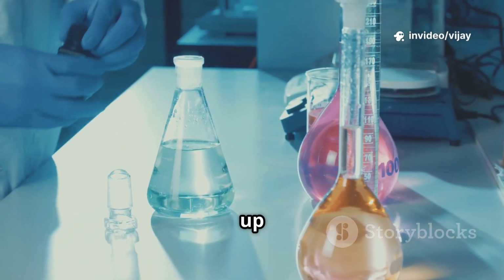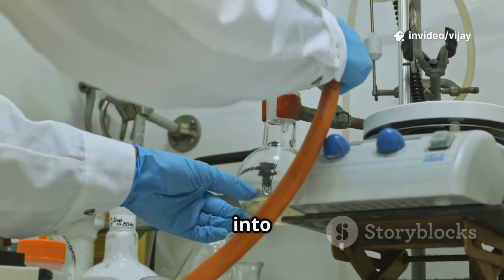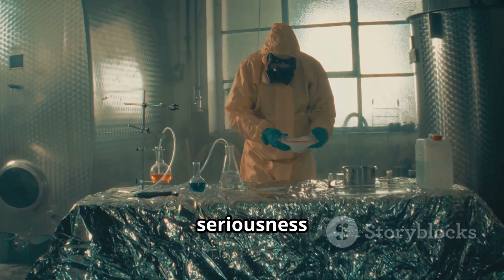So to wrap up, ozonolysis is a powerful way to split double and triple bonds and turn them into useful carbonyl compounds. Just work step by step, keep everything cold, and treat ozone with the seriousness it deserves.